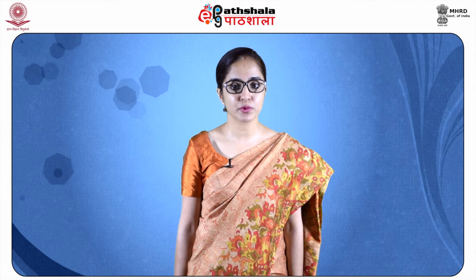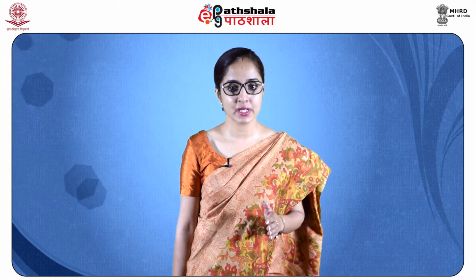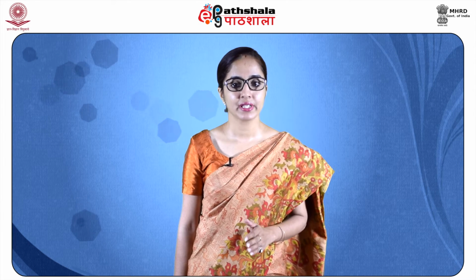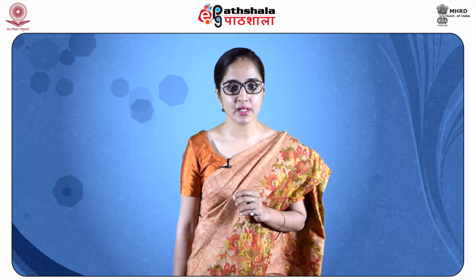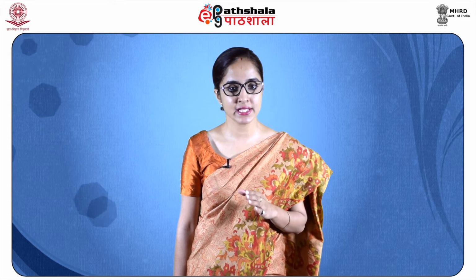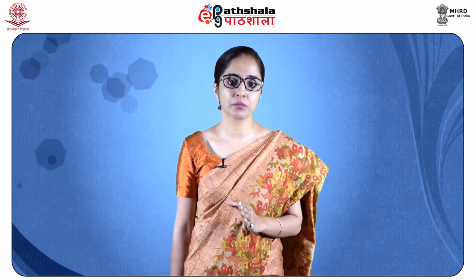For detecting the protons exchangeable with D2O, either the spectrum is recorded in D2O or a few drops of D2O are added to the sample and the sample tube is shaken properly before recording the NMR spectrum. The deuterium is not detected in the proton NMR as it absorbs at a different field strength and hence there will not be any coupling or splitting due to the proton which has been exchanged with deuterium.